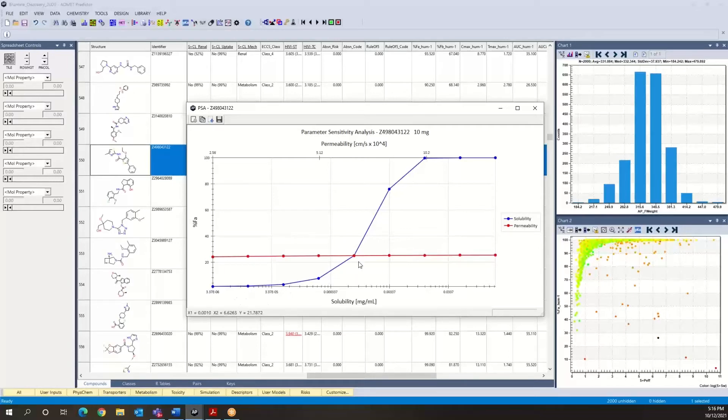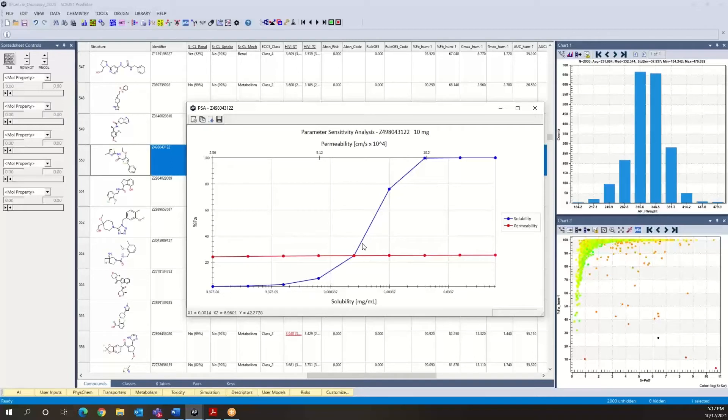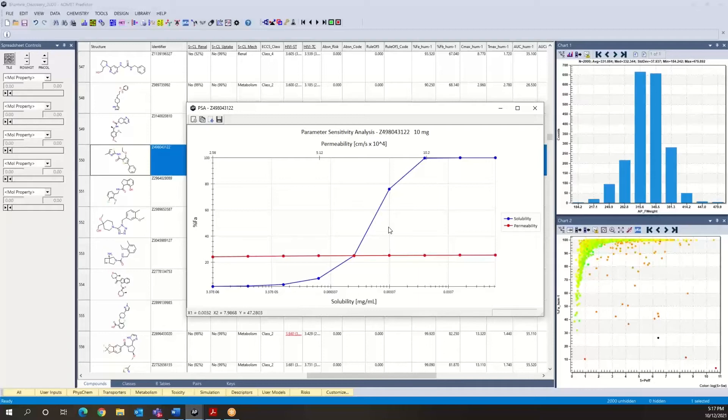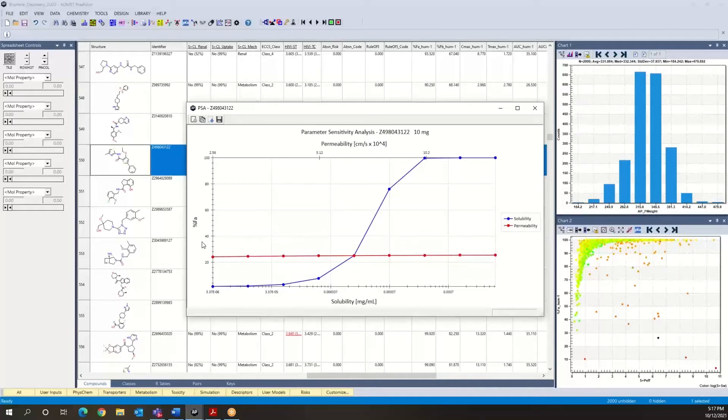On the other hand, if we fix permeability and vary solubility, then we can potentially get a pretty dramatic effect on the projected fraction absorbed of that compound. In this case, it would be very useful to seek enhanced solubility for this particular compound and rescue it since it is the solubility parameter that is gating the fraction absorbed.